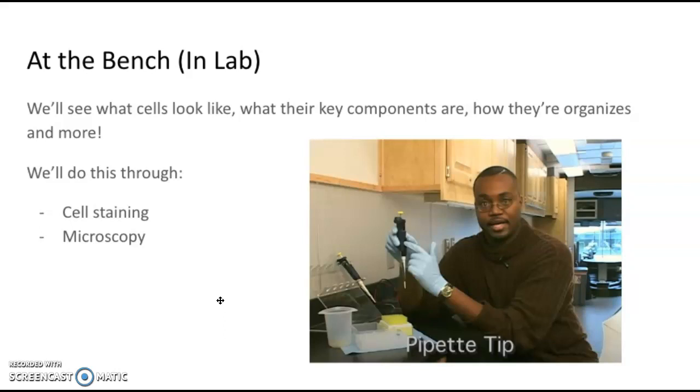Right, so that's something that we use in biology: we use pipette tips and we use micropipettes. And you'll see that this week. But what I'd like you to do is watch this quick video and he'll give you a really brief introduction of what a micropipette is and how we use them. You'll be using them this week in lab. Both days that you're with me, you'll be in the lab. And we've also got some really cool remote assignments planned for the days that you're not with me.